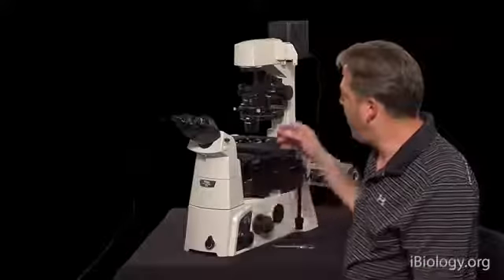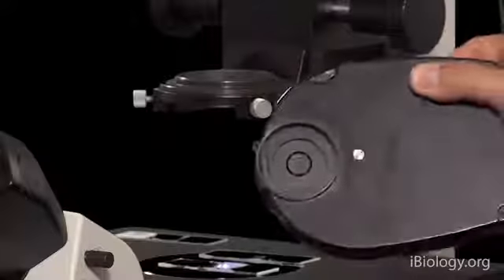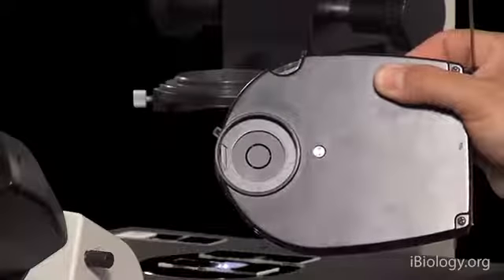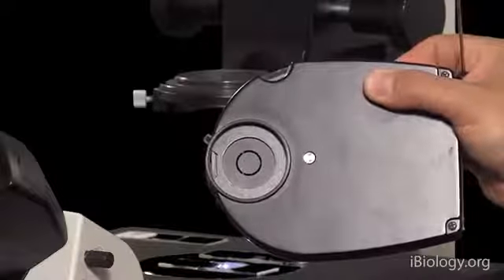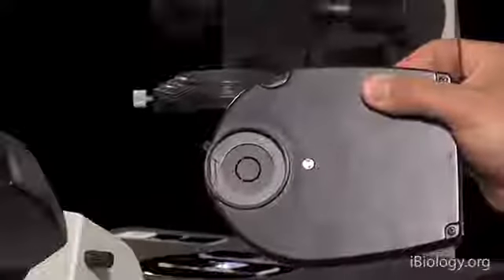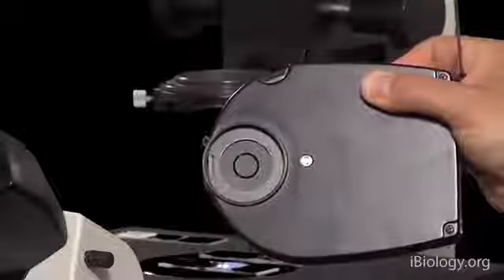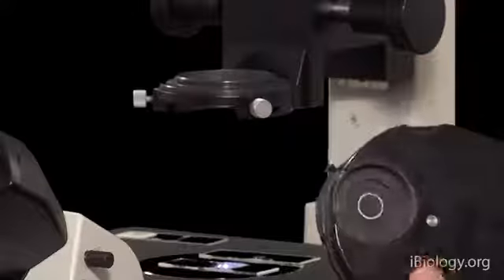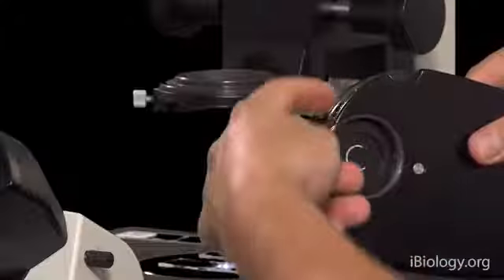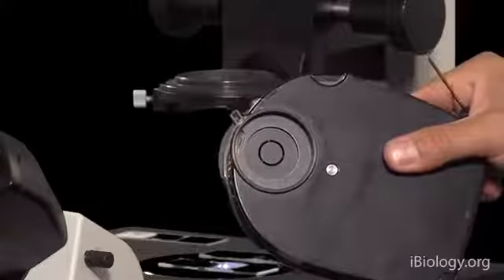You also have a phase annulus that is in this condensing system right here. There's your phase annulus, so you can see right through it. It's basically just restricting the angles of illumination in the microscope system. So that's basically all we're doing. We're restricting those angles of illumination and then overlaying in a conjugate aperture plane the phase ring with this annulus. Okay, and there's two adjustments that move this annulus in two axes so that you can move it around to align it in the condensing system.